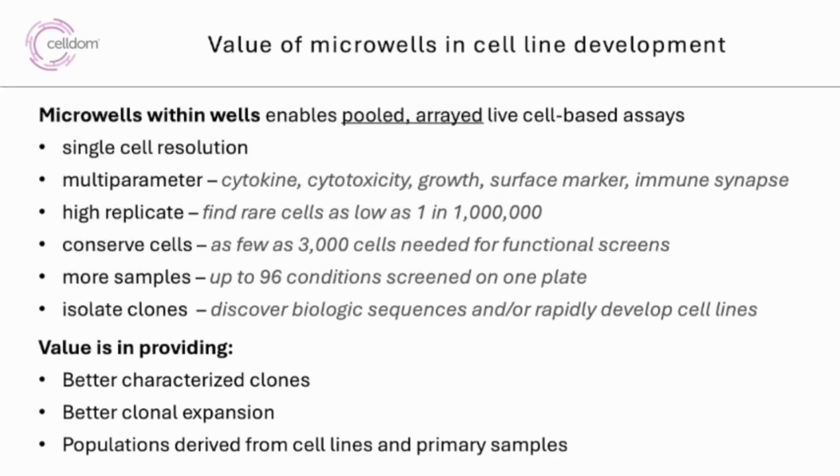So I hope that my talk today has convinced you that microwells have a number of very compelling applications in cell line development. The microwells within wells concept is a pooled arrayed live cell biology platform.